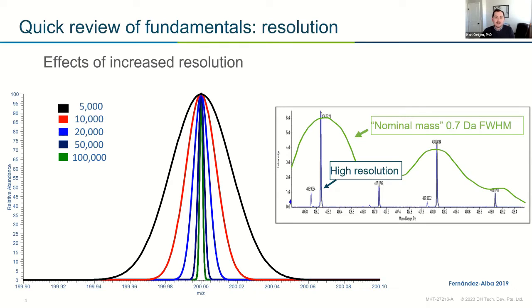So in the green, you can see this nominal mass spectrum that's hiding the smaller 405 ion that was obscured because of the wide mass range. Whereas with accurate mass, we don't have that problem. But it's one of those things, it's diminishing returns as we go above that 40,000 threshold for what we're actually able to accomplish.